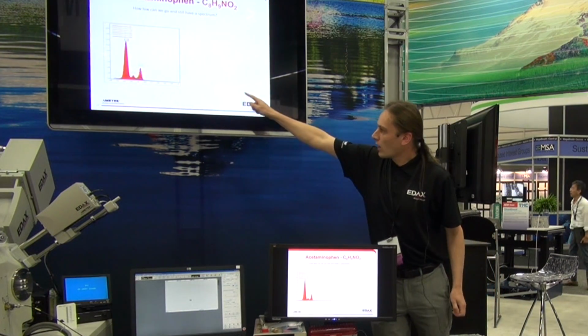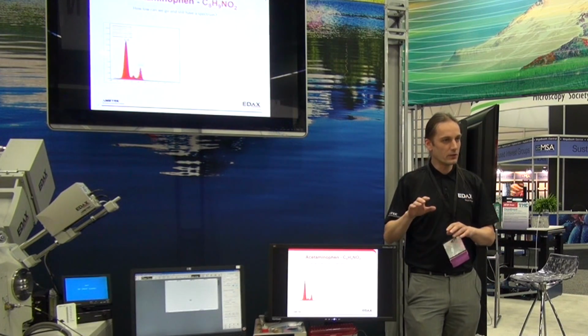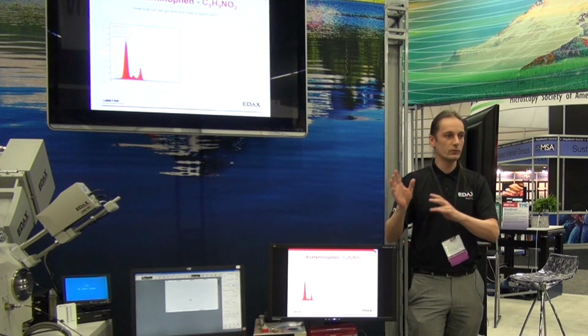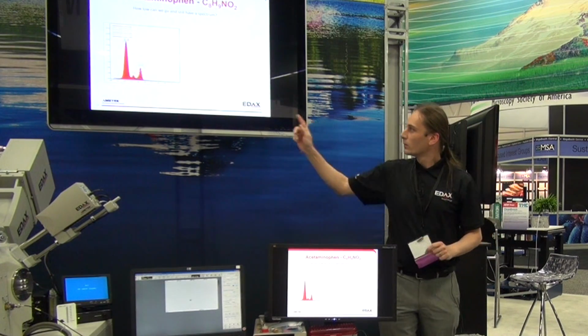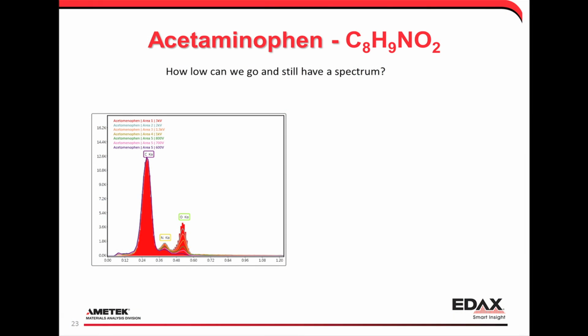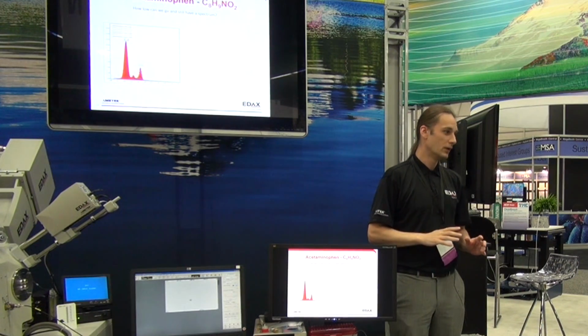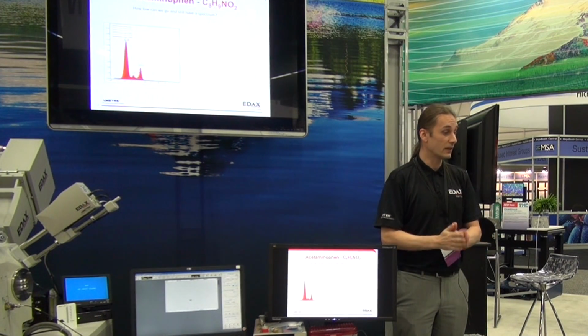But look at the oxygen peak. As I said before, we had this change in ratio depending on our excitation volumes and escape volumes. The problem with the oxygen peak is that 600 volts is not a lot of overvoltage compared to the oxygen absorption line. We're running into the problem where we can't excite the X-ray lines anymore. And that's why we have a relative decrease of the oxygen peak. It's not just our change in excitation volume. It's also that we are exciting them less efficiently.